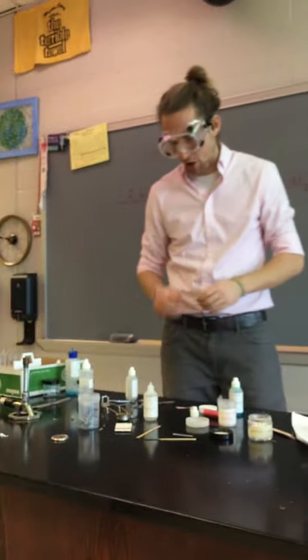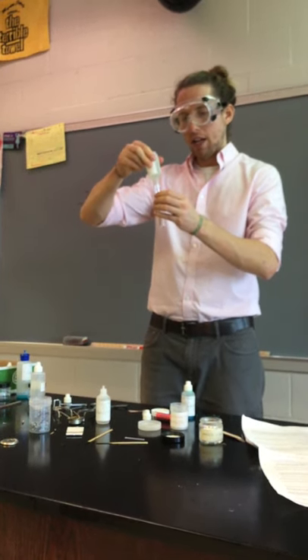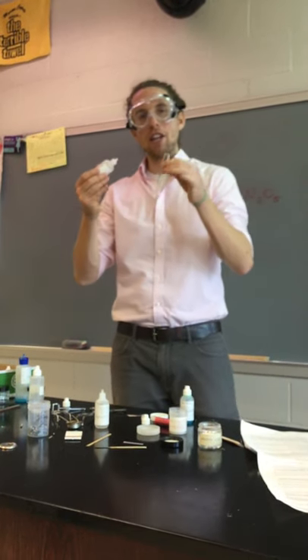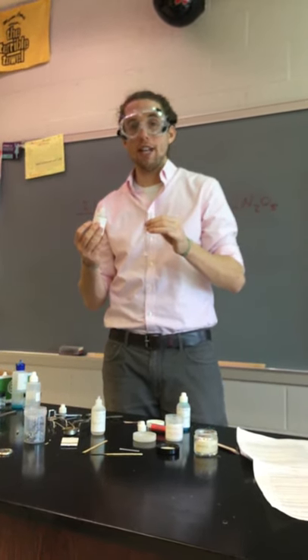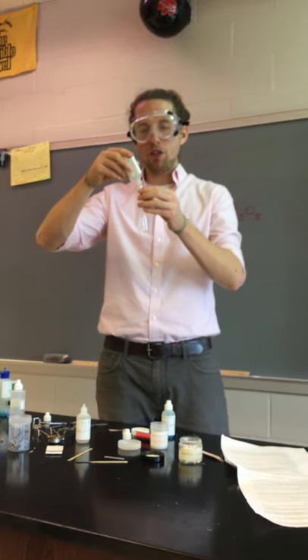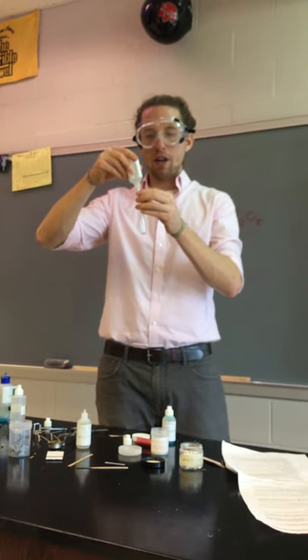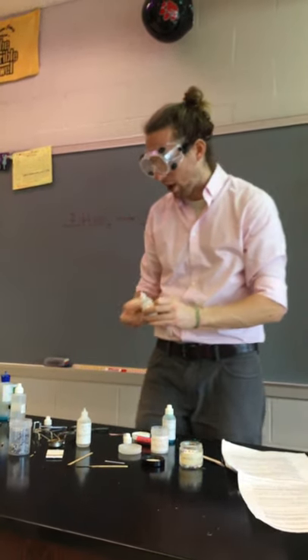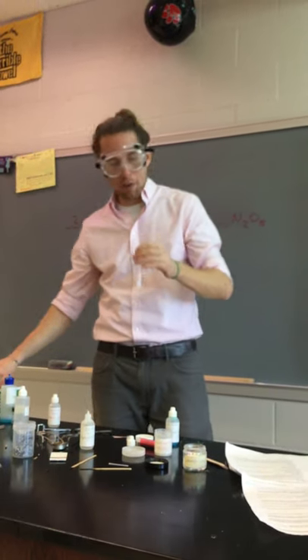In this case, we are going to take sodium hydroxide, NaOH. Now we know if this thing has OH in it, that we are likely looking at a base. And I actually did that one incorrectly, and here's why. It was a little bit on purpose. You'll notice that I just started adding a bunch of sodium hydroxide into this test tube. This one actually is one where we care about quantitative, so we care about numbers. So I'm going to restart. And I'm going to specifically count 20 drops of my sodium hydroxide. Now while I count those 20 drops, it's important for you guys to notice that this is one molar sodium hydroxide. So I know we haven't talked a whole lot about molarity yet, but we will. This is going to allow us to basically determine the concentration of an acid that we add.